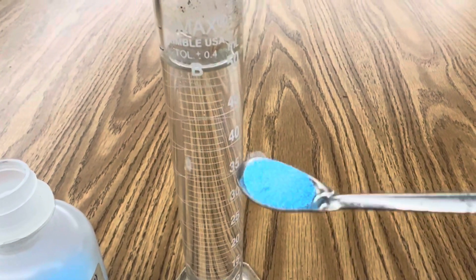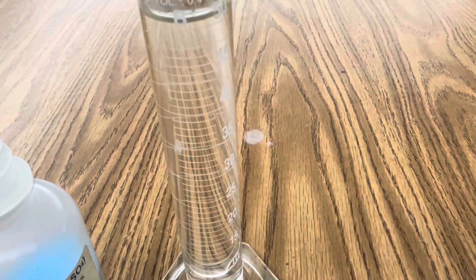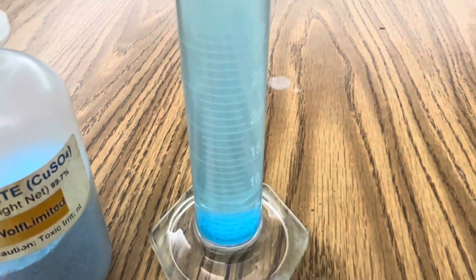The first step is to add four grams of copper sulfate to 50 milliliters of water in my graduated cylinder. I'm going to stir the solution until it becomes aqueous.